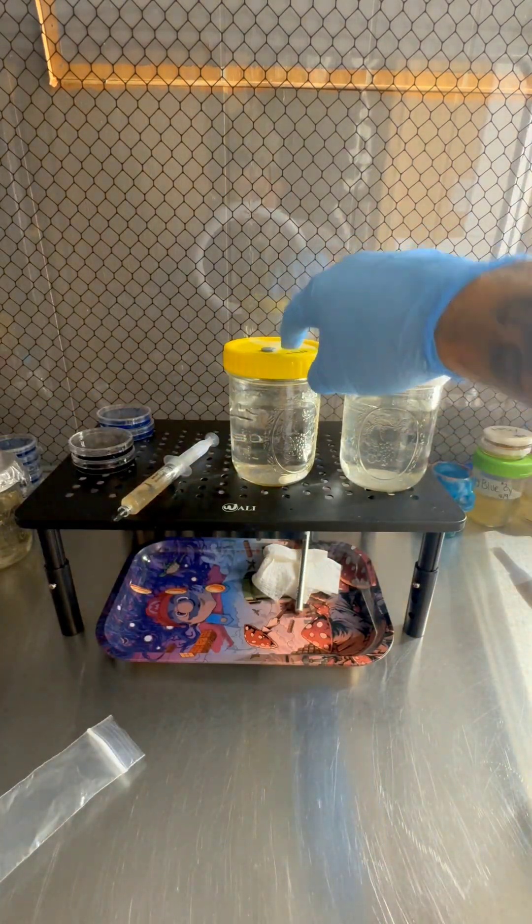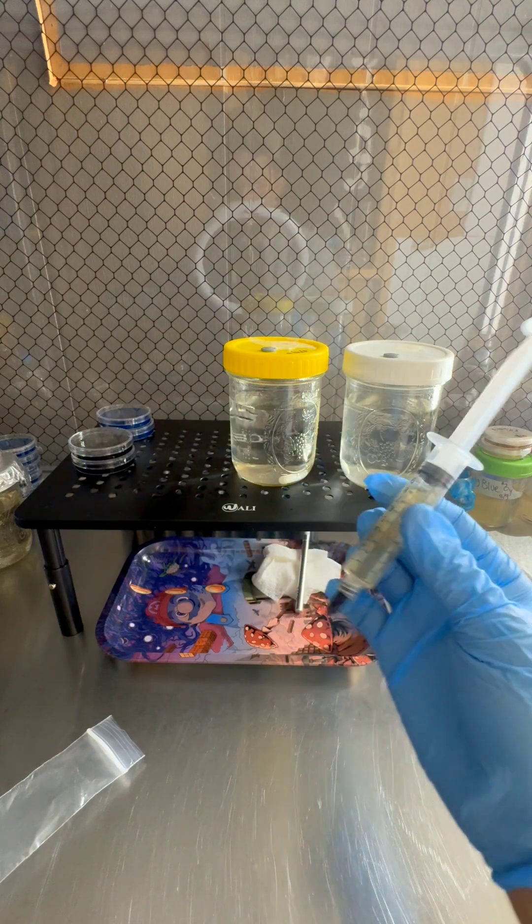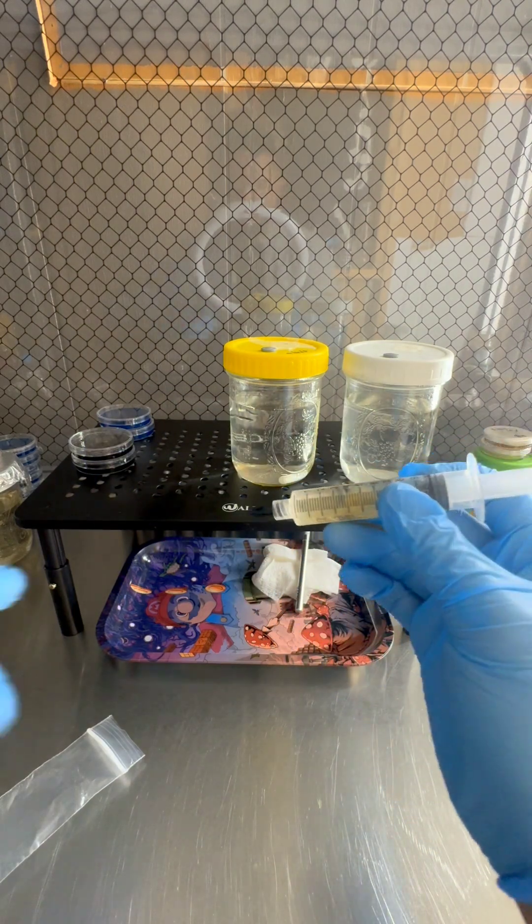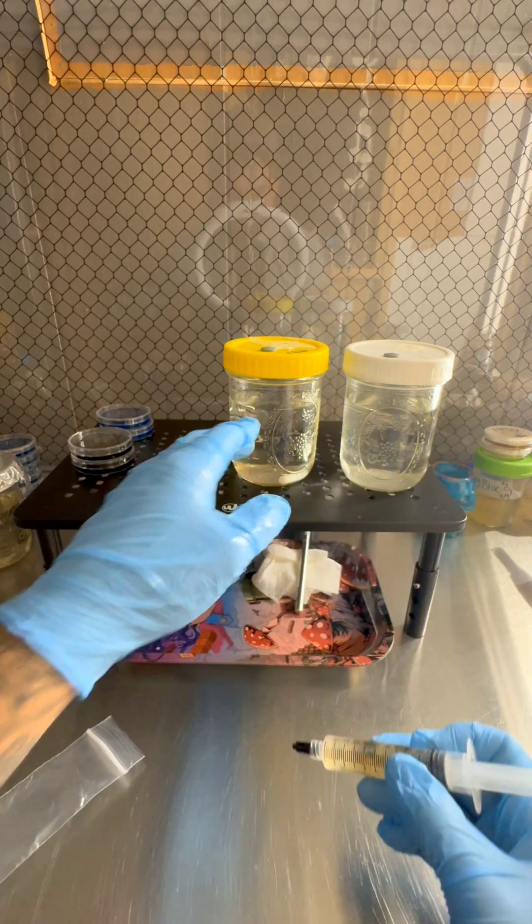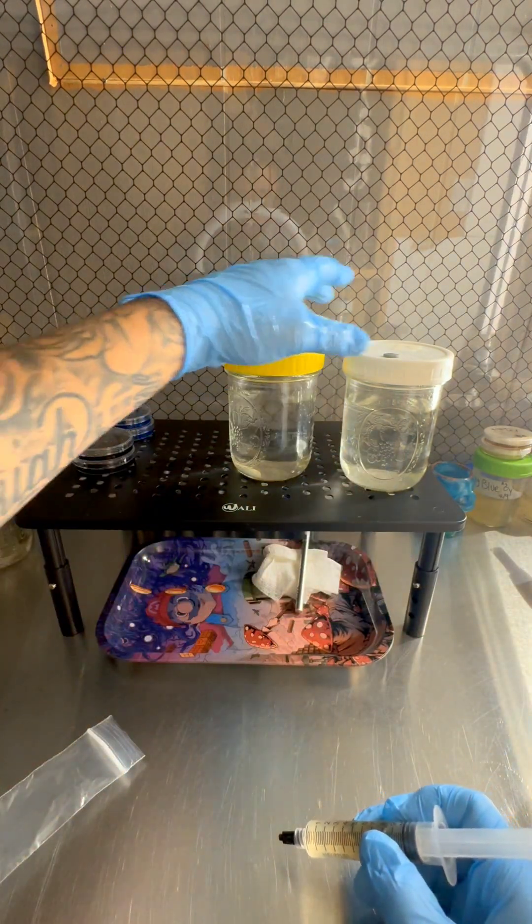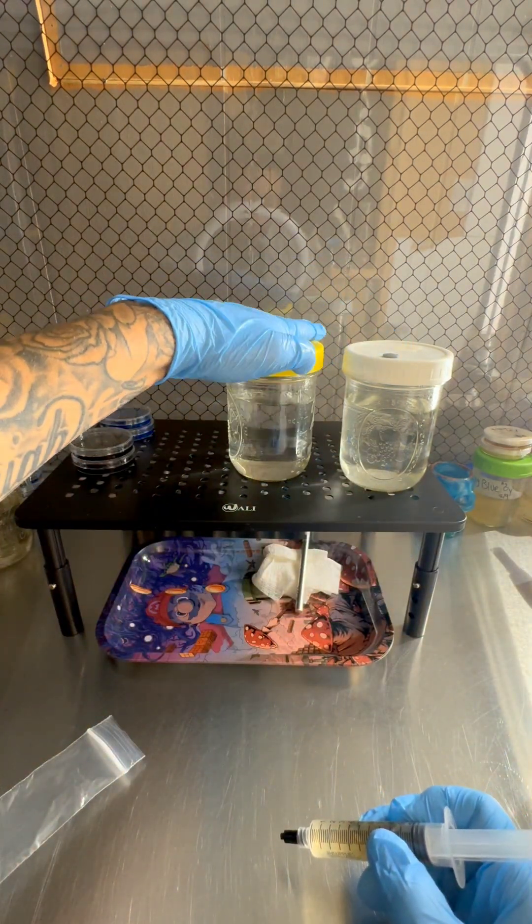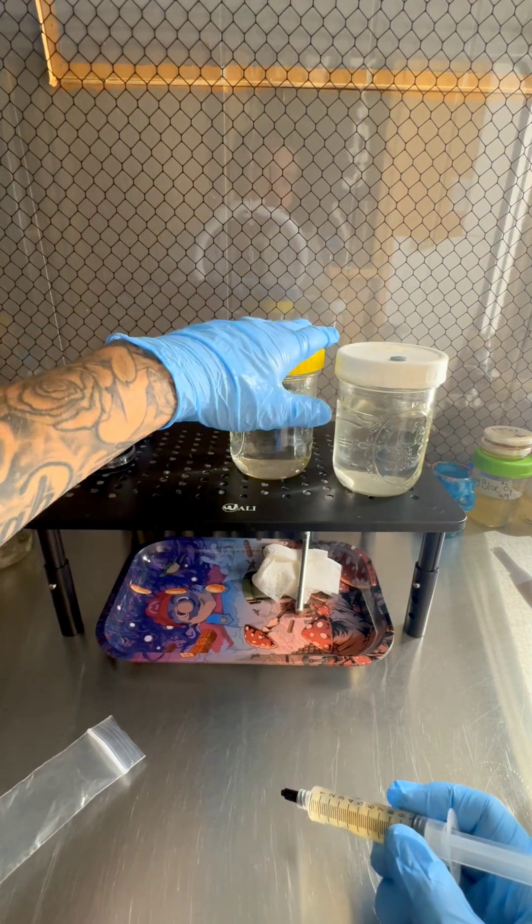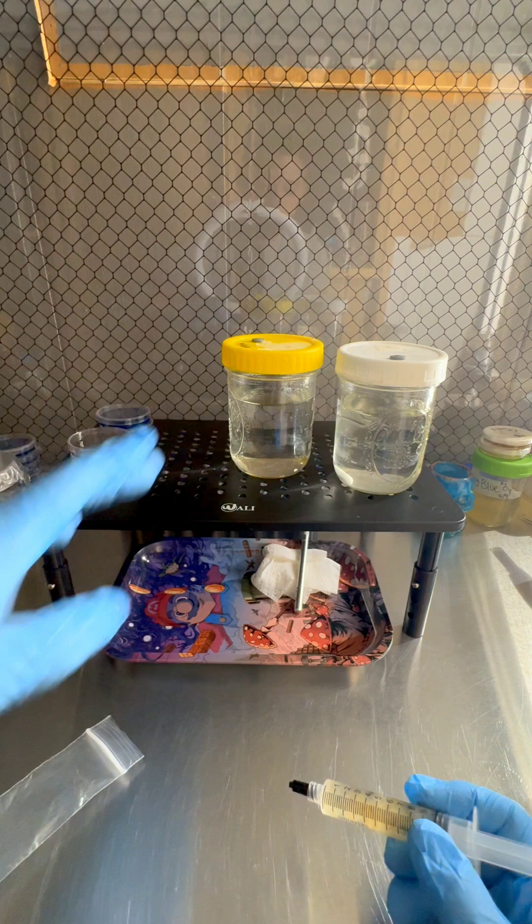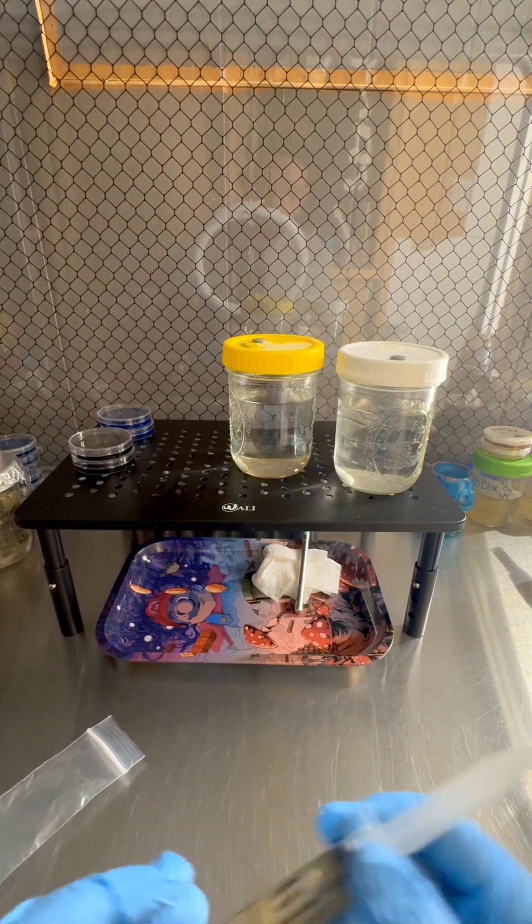So we're gonna inoculate both of these jars with this LC. We only need a little bit, so I'll probably use two cc's per jar. And that's gonna turn these into 300 milliliters of liquid culture and another 300 milliliters of liquid culture. So that's a lot. You can actually get a lot of syringes out of that, which is what we want.